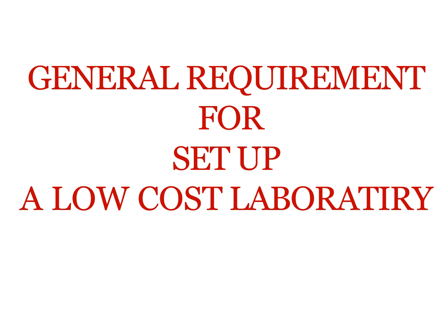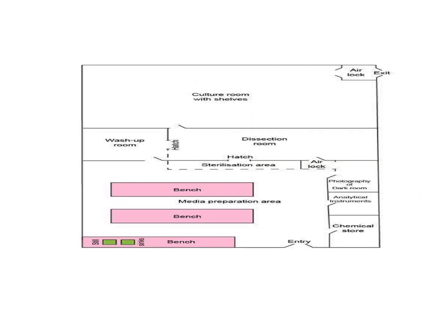Okay. So in the forthcoming slides we are going to see the general requirements for setting up the low cost laboratory. Okay, sir, I want to initiate a low cost laboratory for the agriculture sector, or it may be horticulture or forestry, whatever you want. So this is an illustration or a drawing of a low cost plant tissue culture laboratory.